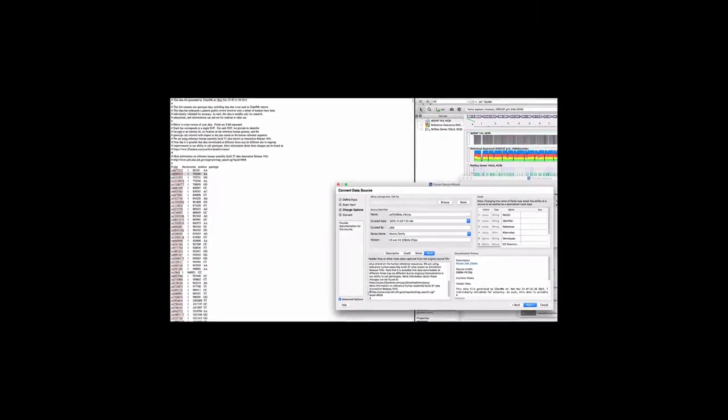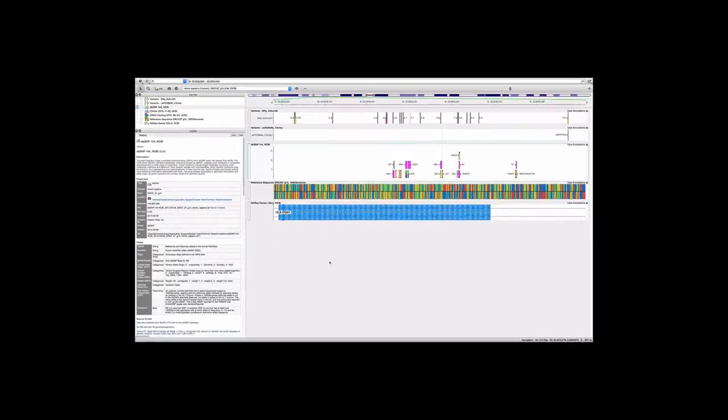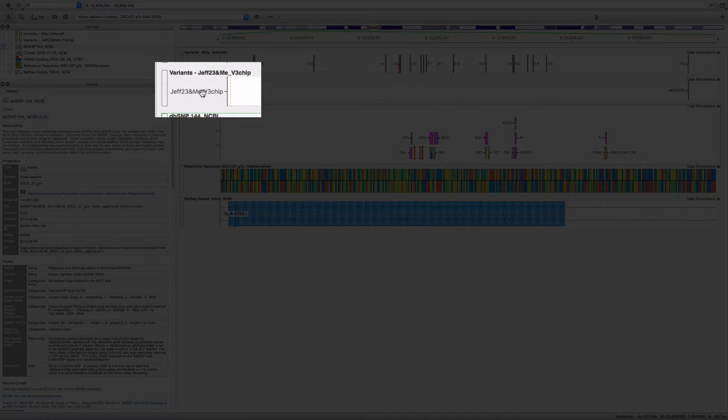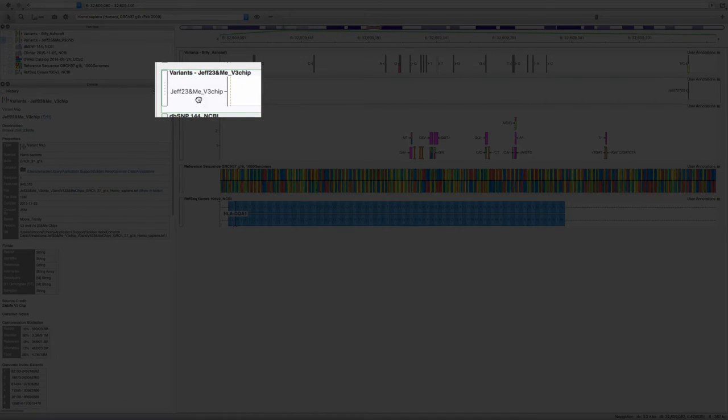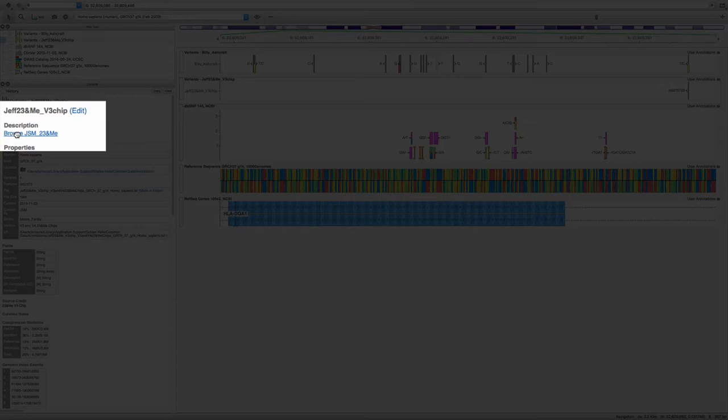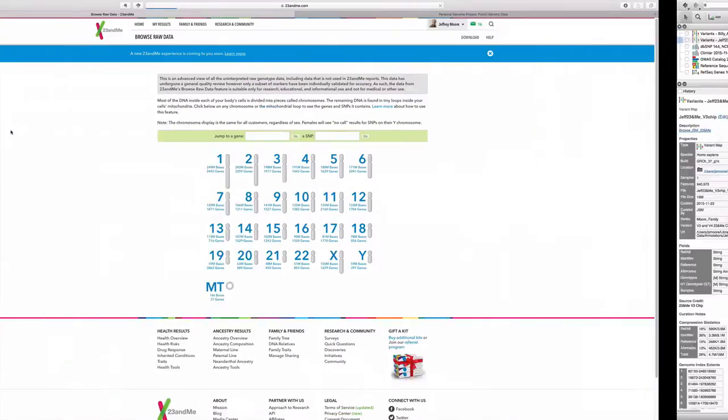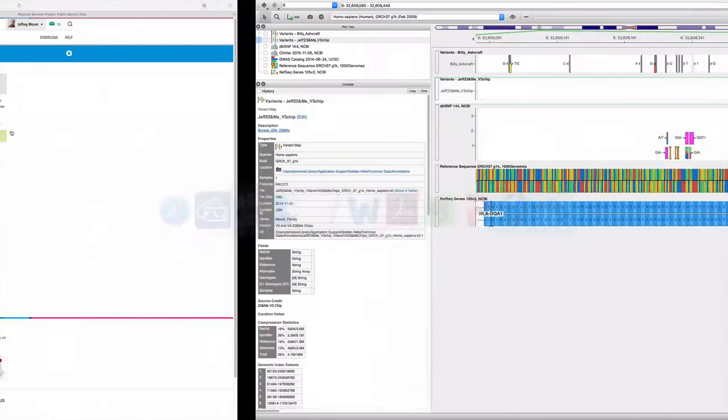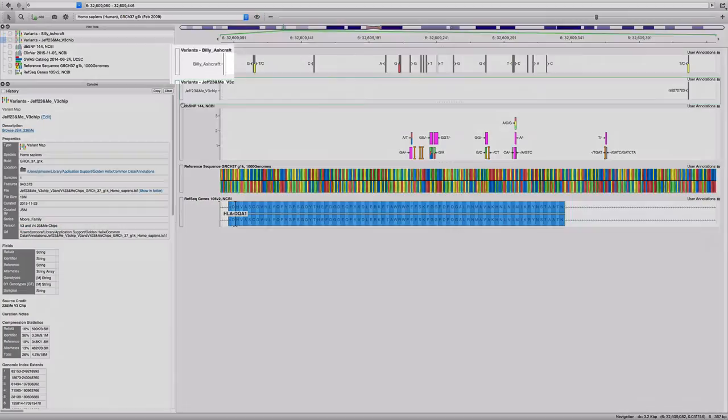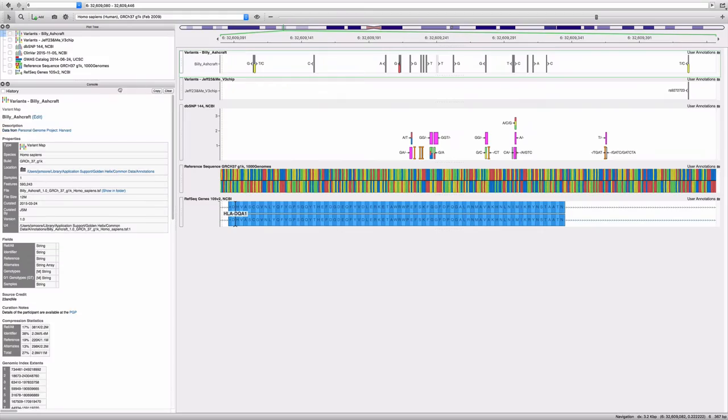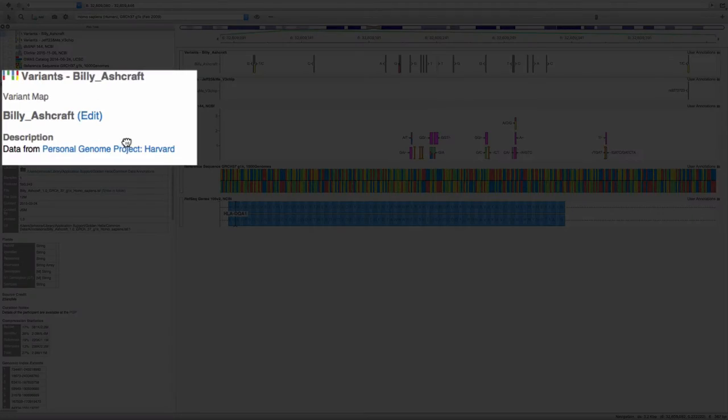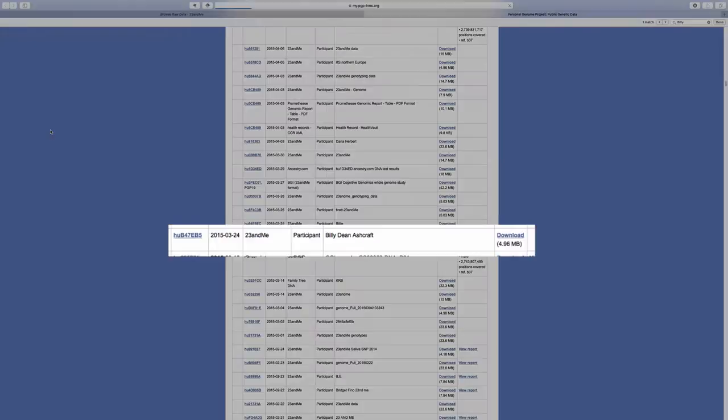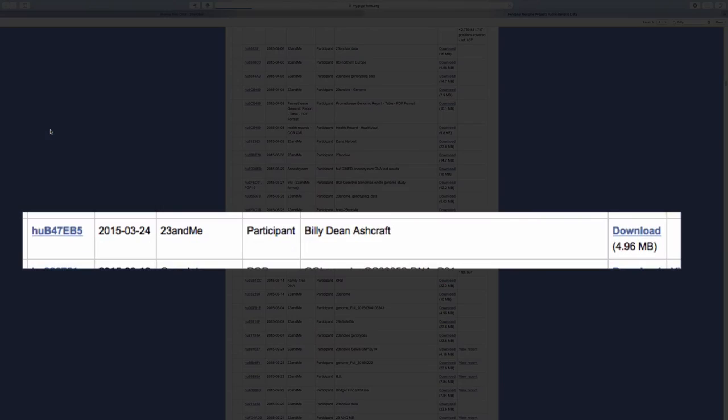When I click on my data track, the console displays the track's description. I can link out directly to my account page on 23andMe. Clicking on Billy Ashcraft's data track, the link reminds me that this was from the publicly available Personal Genome Project.